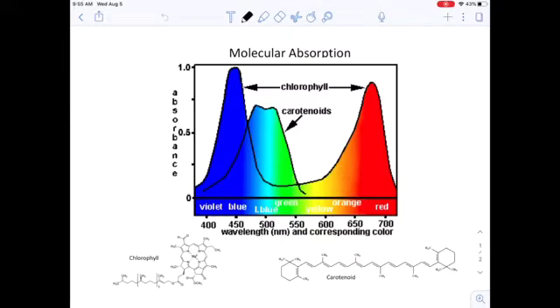Today what we're going to be looking at is the idea of Beer's law. Now before we can get to Beer's law, we have to understand what's going on. What we're going to be trying to do is examine a molecule by the light that it absorbs. So if it is absorbing light, we'd better be sure that we have light that it actually absorbs.